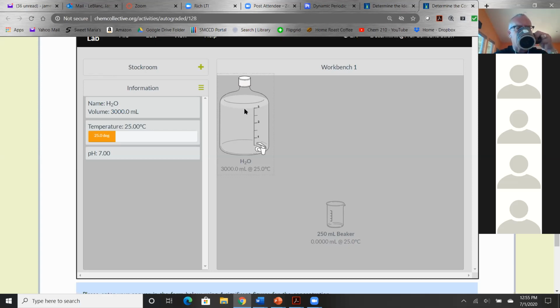Because water is neutralized, I think. No, not really. It's not going to affect the titration. How come my volume of water won't really affect the titration? What am I actually titrating? Is it because water is basically neutral pH level? That's one reason. What's the real reason I'm looking for? I mean, is the water involved in the reaction? No. What are we actually titrating? We're titrating one thing and another thing. What are the two things we're actually titrating? The acid and the base. We're titrating the moles of acid and moles of base.